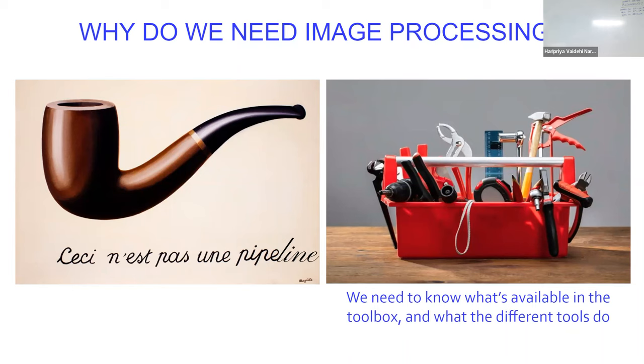So our goal in this workshop is essentially to understand A, what tools are out there? What are the common tools? B, what are they doing to your image? And that's why our approach in this workshop is going to be, you take an image, you apply each of these tools to it, these automated tools, and then you as the human eyeball the result and see what it looks like and develop the intuition for what that tool is doing to your image.